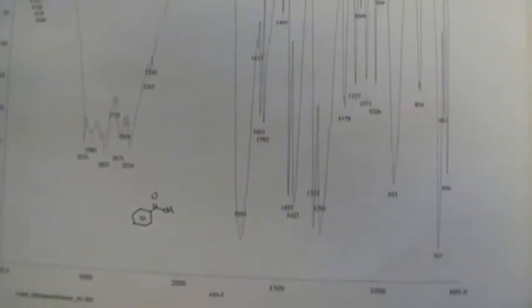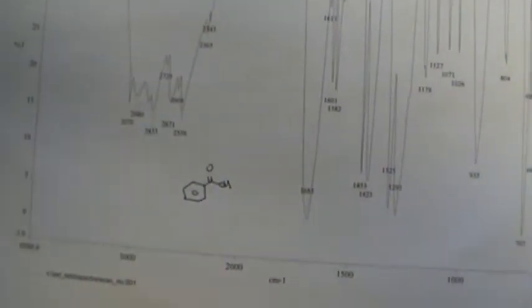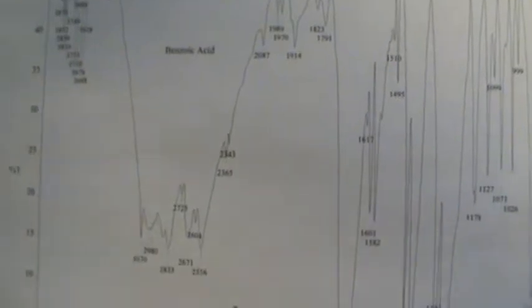The last experiment of the lab manual, at least in 2015, we're going to take benzoic acid and switch it through reduction to benzyl alcohol. So we'll try and make this quick for you guys.